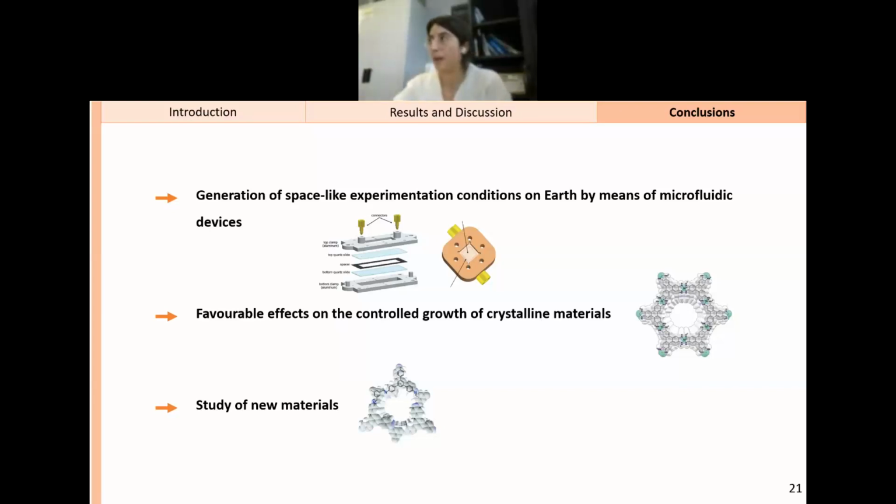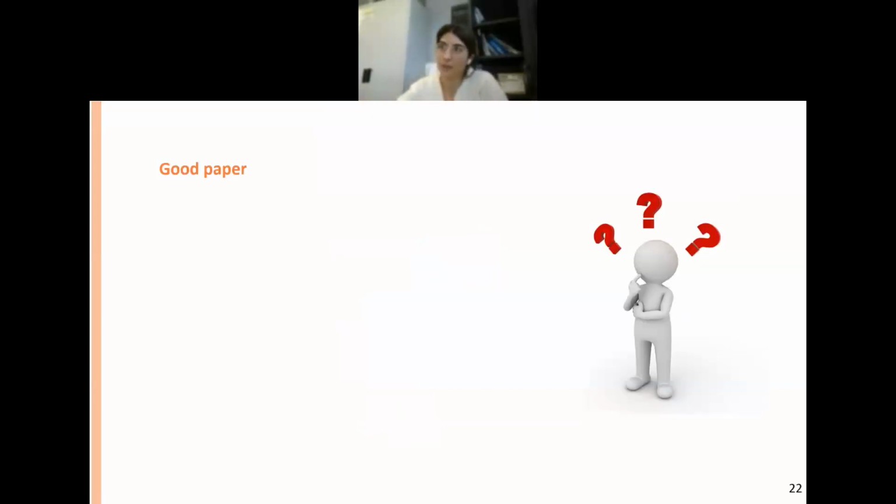So in my opinion, this is a very good paper. First of all, because of the engineering point of view and the design of the microfluidic device, the conditions that you can obtain inside the device help you to study what happens with the crystallization in those conditions without having to send the sample in space.